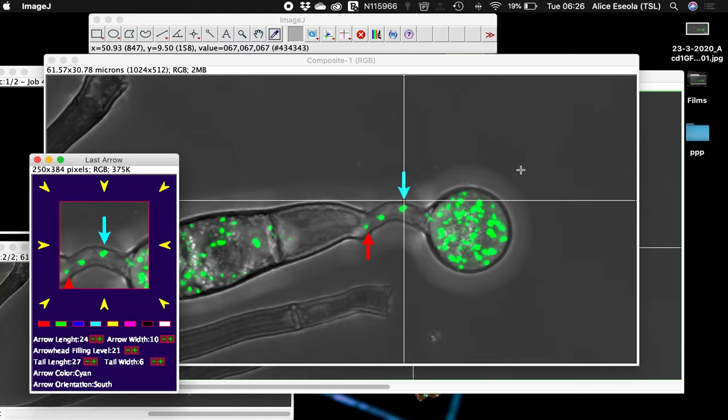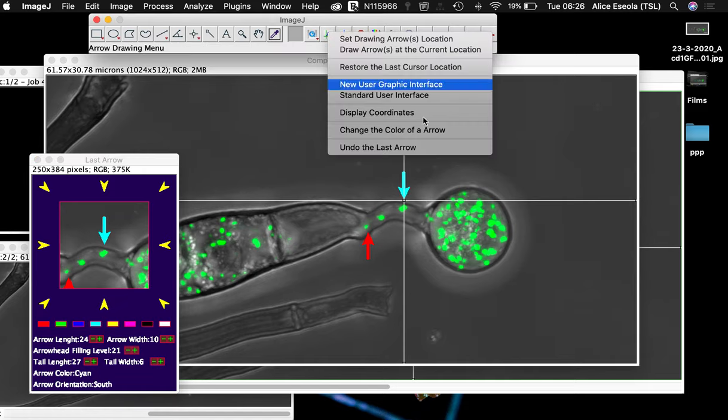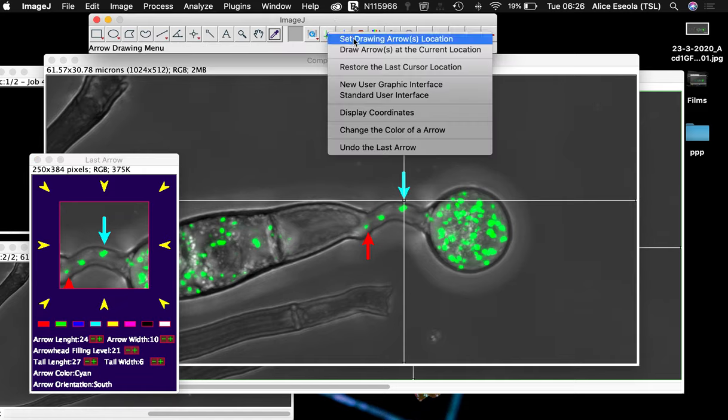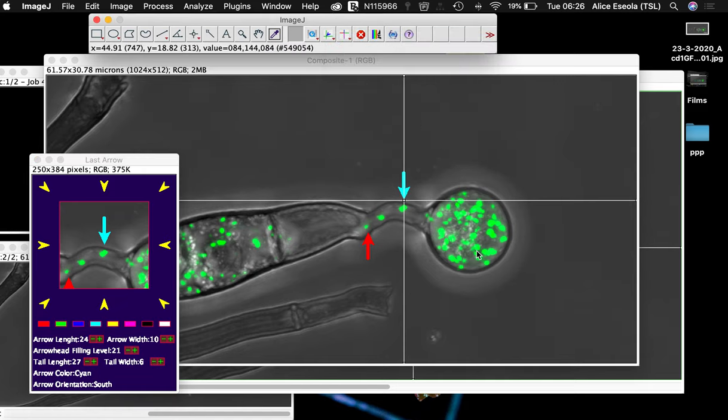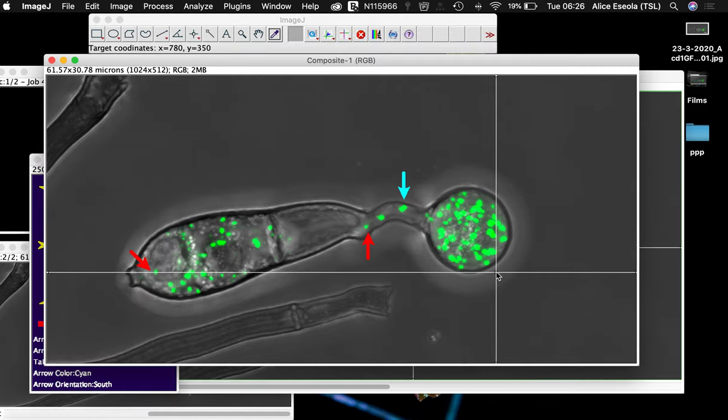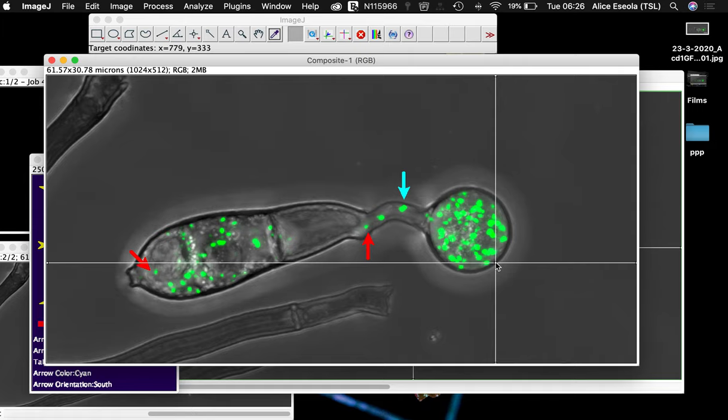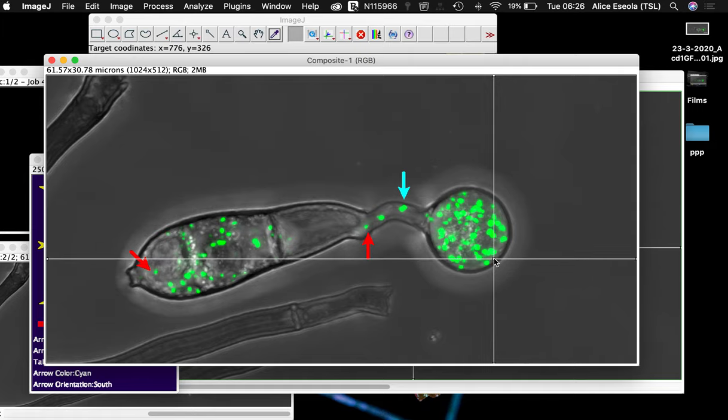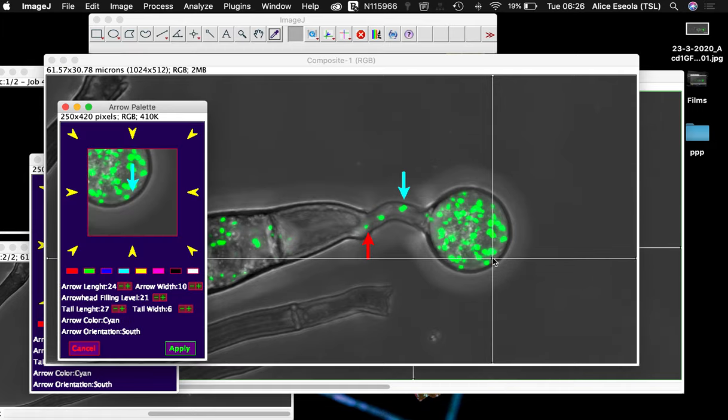Now we can see that we have two different colors. If we are interested in pointing at something else in our image, let's say this clustered object, we can decide to use a white color.